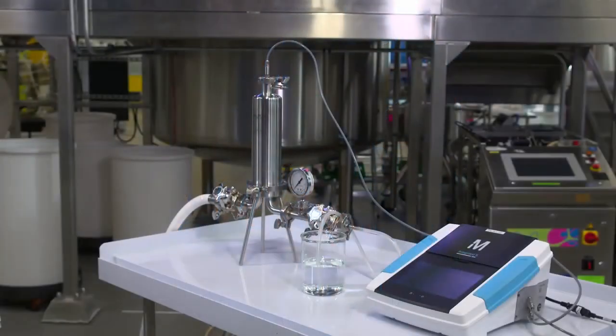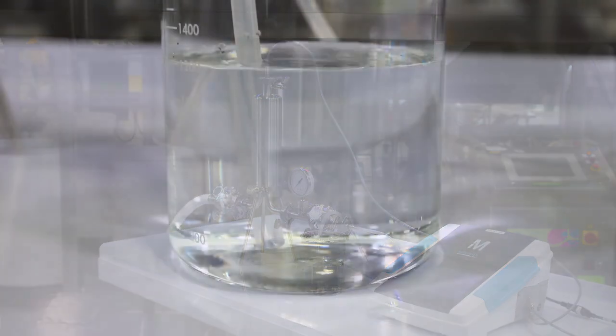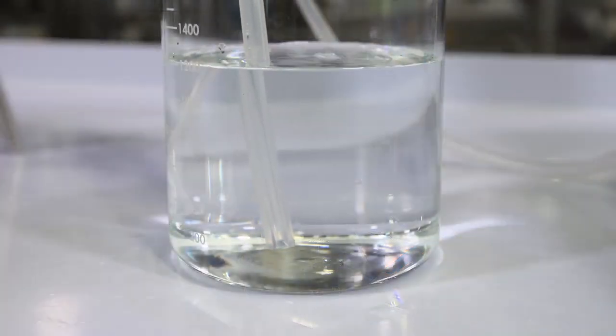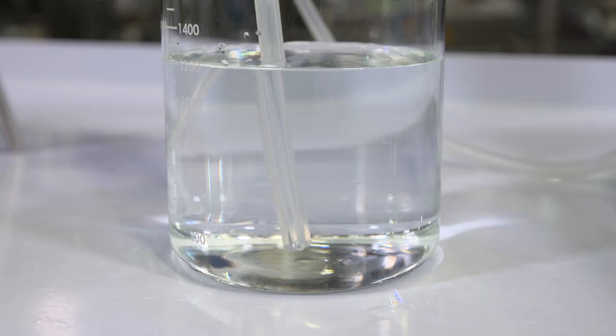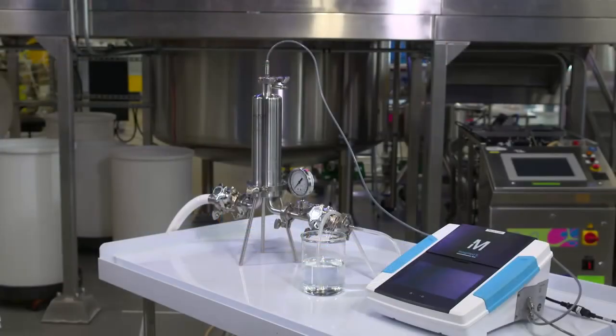But with this 10-inch filter, which has a couple thousand times more membrane area than the syringe, at pressure below the bubble point, we can see a steady flow of gas bubbles due to diffusion. How do we know if the flow we're observing is due to diffusion or due to exceeding the bubble point? We can't just look at the bubbles, we have to measure the flow. So with larger area devices, a diffusion test gives us a sensitive method for determining if the bubble point has been reached or not. In other words, a sensitive way to check for defects in larger membrane area devices.